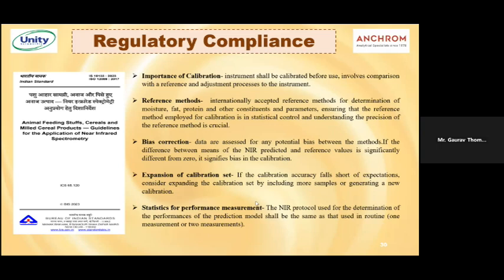Next is the expansion of the calibration set. This is another feature that this ISO talks about. Suppose you have a ready-prepared calibration for your samples, but you've upgraded your sample by adding a few more steps or so. Now the older calibration is no longer giving you exact or good results for your updated sample. But this ISO 12099 also tells you how you can expand an existing calibration with more data points, giving you reproducible, reliable results every time you analyze your samples.